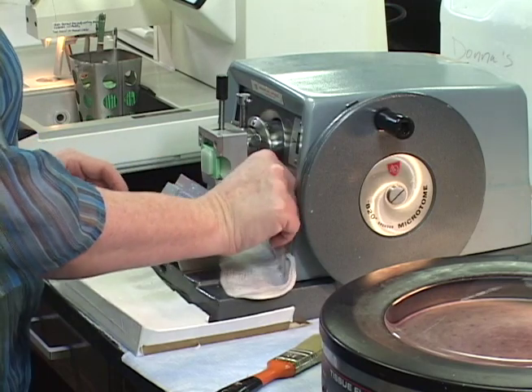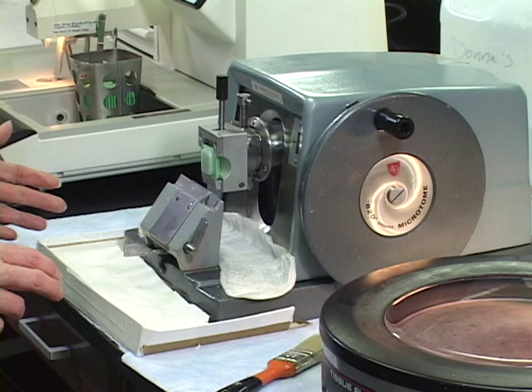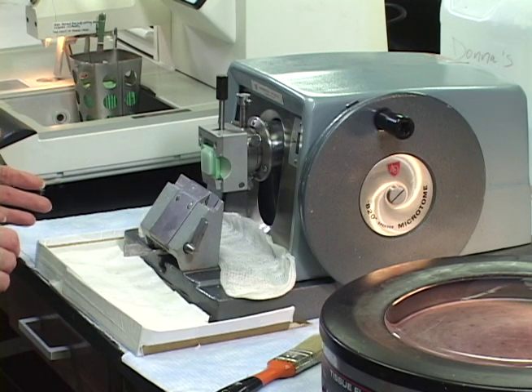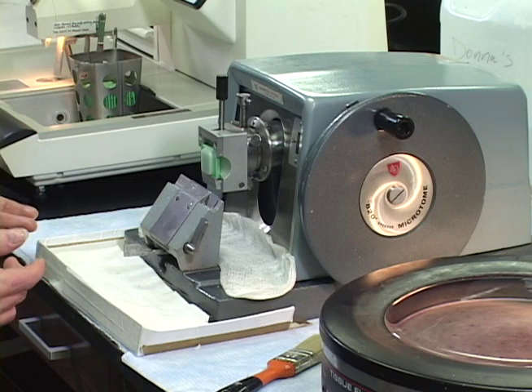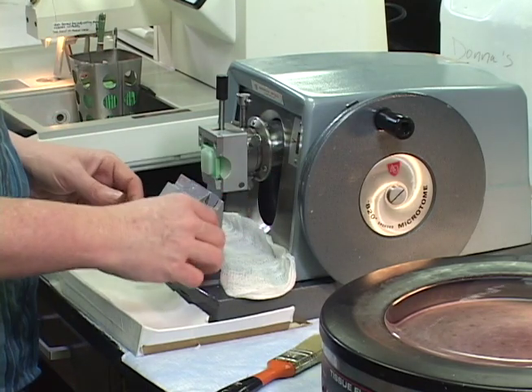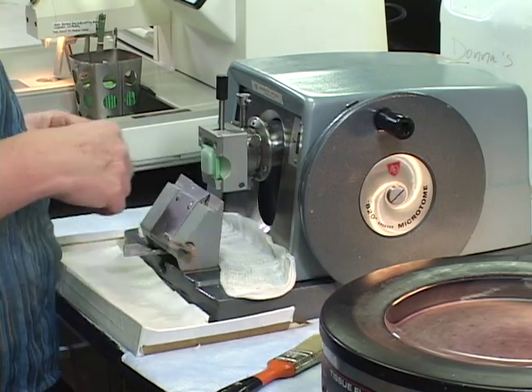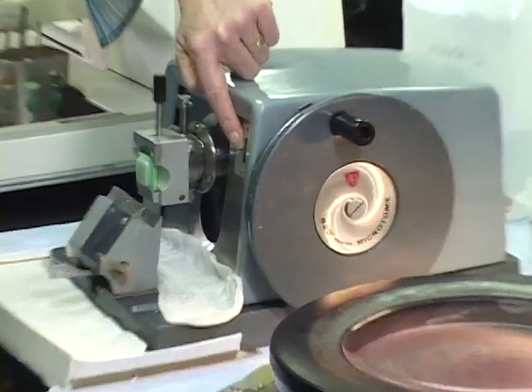If you can use this machine and learn to use this particular machine, which is quite a nice one actually, you can pretty much go to any machine in the future, newer or older, and have an idea of how it works. I have the micron level, this little gauge here in the front. I'm going to remove the blade as I'm showing you this. This little gauge here in the front is our micron level.